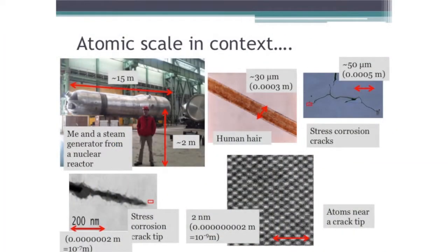Okay, so this is just a tiny crack in one of the small tubes inside that big component. And that crack is so small, you wouldn't be able to pass a hair through it. Okay, so it's an electron microscope image.